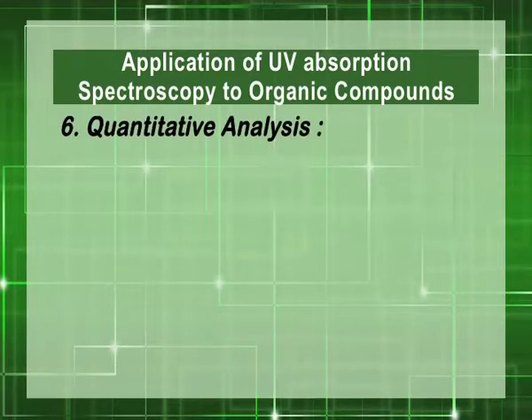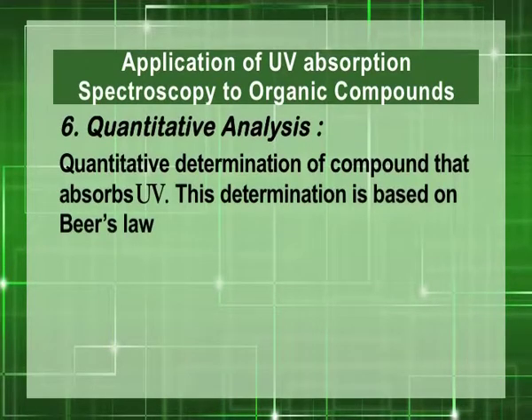Coming to quantitative analysis, quantitative determination of compounds that absorb UV. This determination is based on calculation by Beer's law.